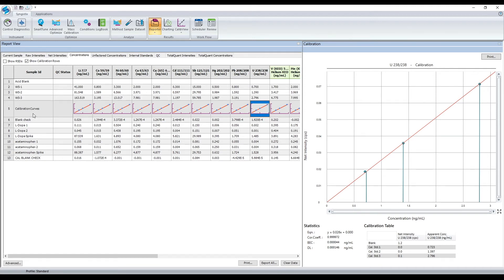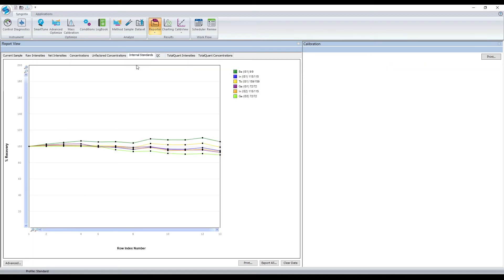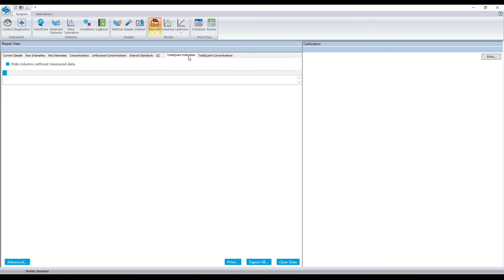In the reporter screen, you can see raw intensities, net intensities, concentrations, unfactor concentrations, quality control results, and very importantly, a chart that shows you how the internal standards performed during the run. In addition, if your method included total quant data, you would have total quantitative or semi-quantitative results shown in these tabs.